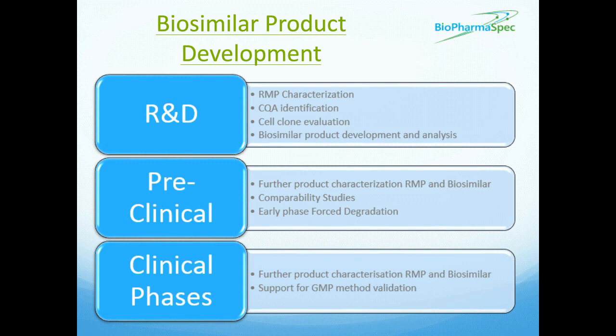So quite often you will also have to test the batches that you've used for the clinics, phase 1, phase 3 in biosimilar method development, and this will help give you more information and a greater understanding of what's going on, and give you a greater ability to define and decide whether you can call your biosimilar or not.